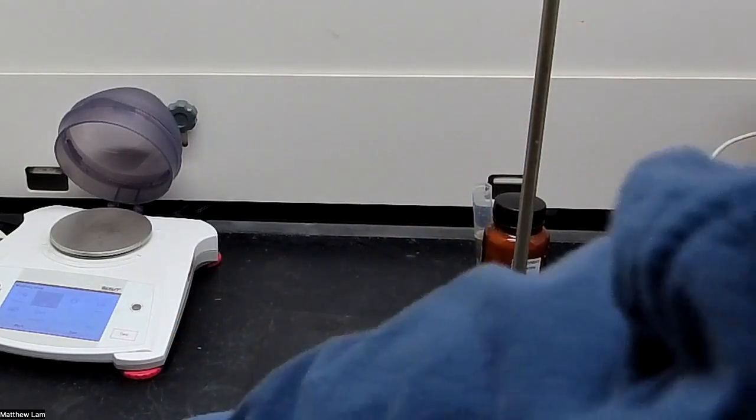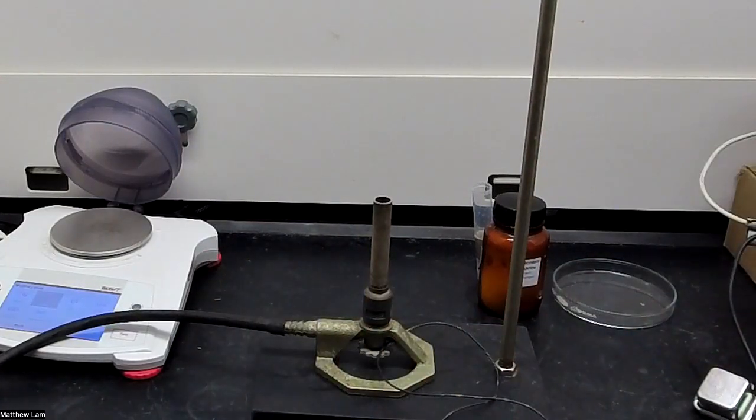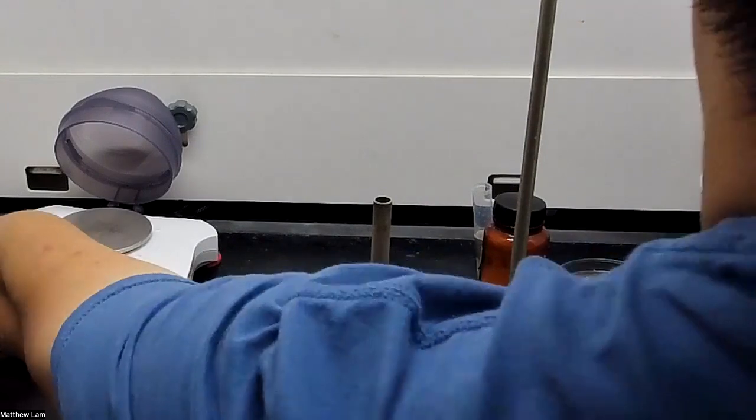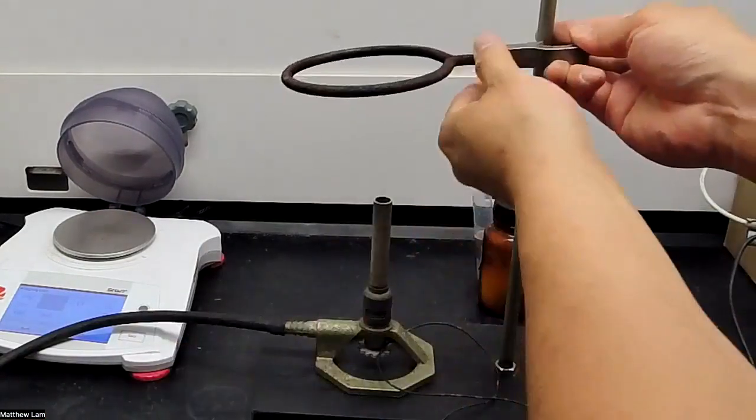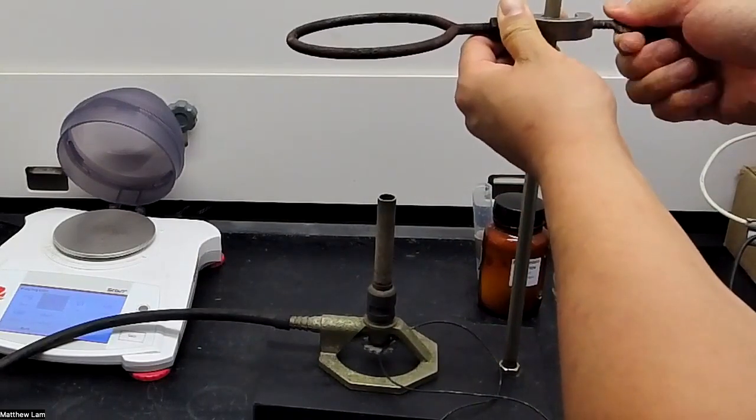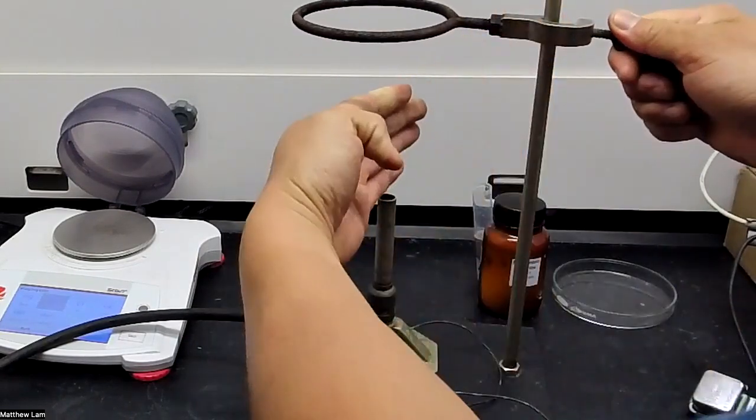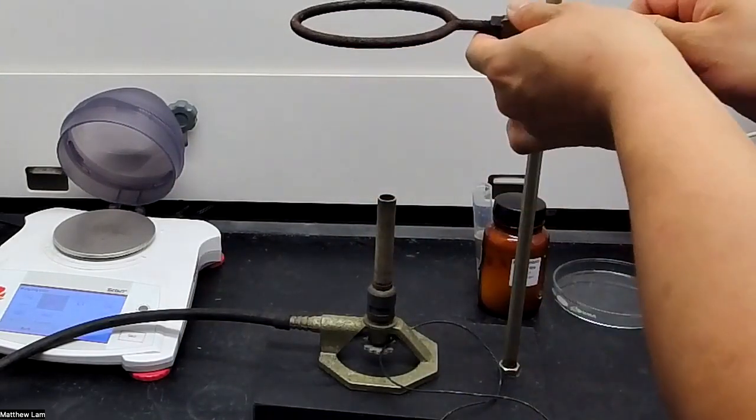So for this apparatus, we'll have the Bunsen burner on the bottom. We'll have the ring clamp right over here, right above it. It says about 10 inches from the Bunsen burner. I usually like to say like a hand and a half, so maybe about there is good.